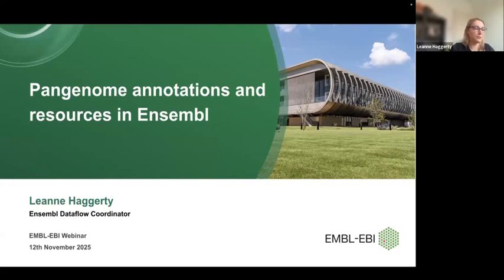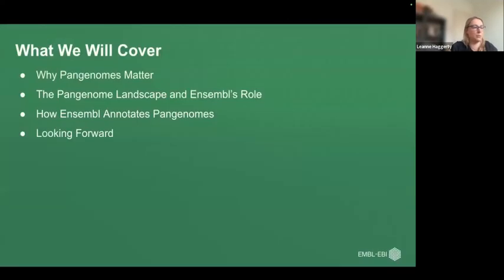following this webinar. So over the next 30 to 40 minutes, I hope to walk you through very briefly what pangenomes are, because this has been covered in the rest of the webinar series, but we should touch on it again, why they matter, and then how we're representing, annotating, and integrating them within Ensembl. So as we say, this session is part of the broader pangenome webinar series, and today I'm going to focus on how these concepts are implemented in large-scale data resources, in particular Ensembl.